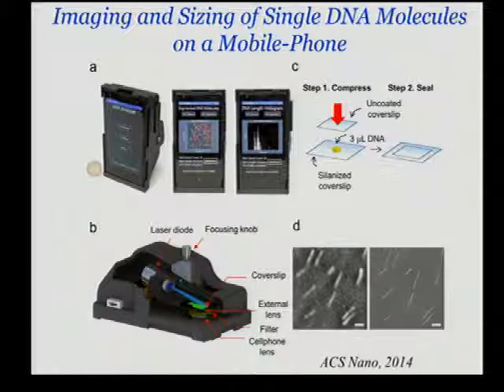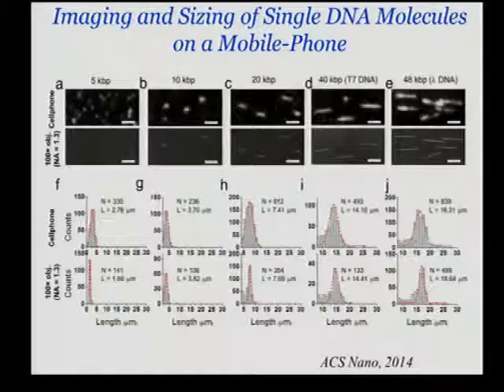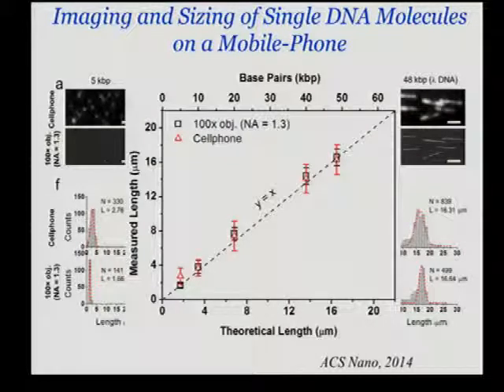And the sample prep is pretty simple here. It's actually based on surface friction. They're not oriented well, but who cares, because it's an imaging-based system. These images are sent to a server, which, based on the point spread function of the system, essentially is trying to measure the length of the DNA. We care about the length of the DNA because we want to bring gene-specific imaging to this platform. Our length sizing accuracy is about a kilobase pair. 1 kilobase pair for 10 kilobase pair and longer DNA segments, we can actually measure the sizes. So it will be useful for actually bringing in gene-specific measurements.